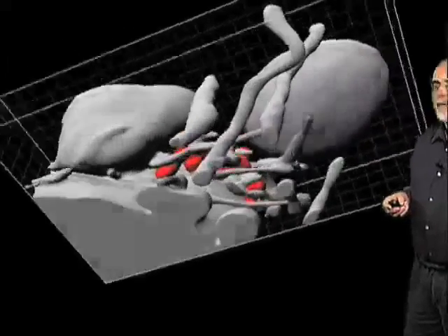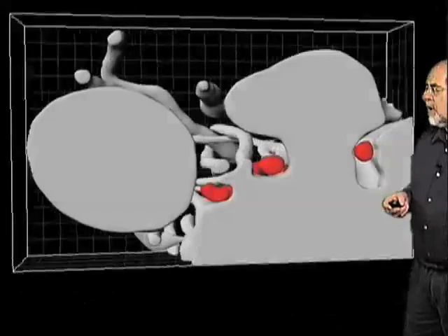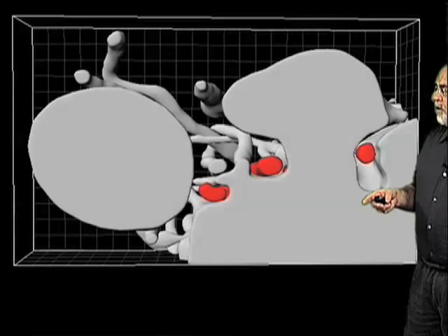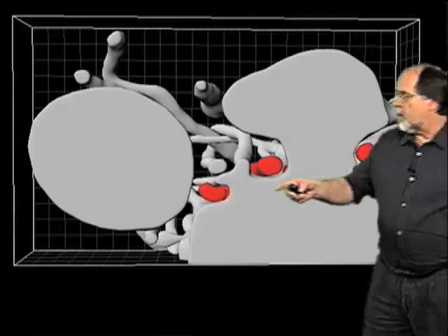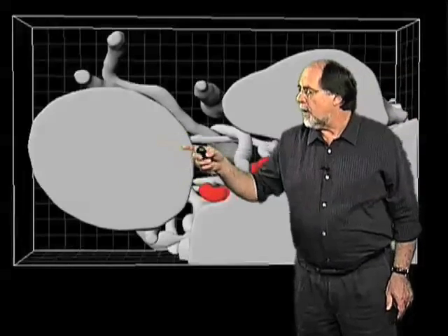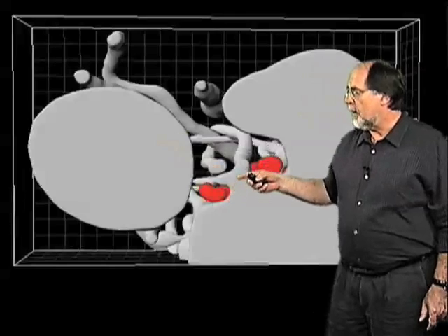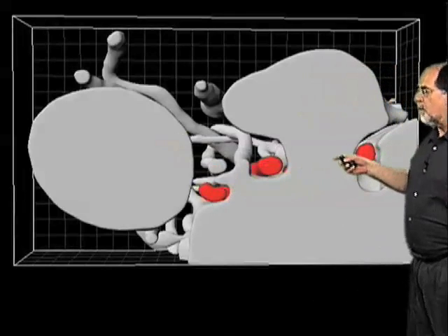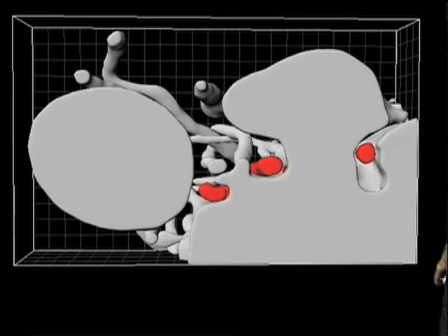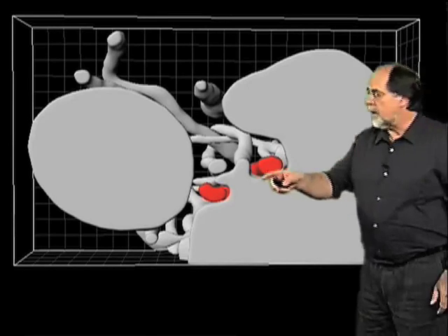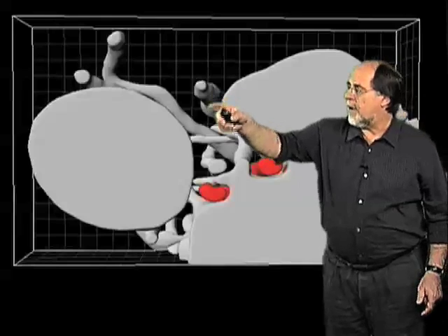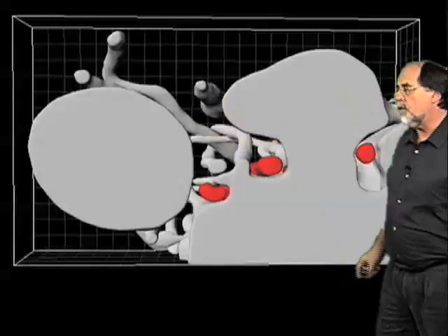The viruses have been pseudo-colored red here and what you see is that the cell surface is modified. You have these blebs forming and the viral particles seem to be endocytosing on the backside of the blebs into the cell. But you also can see here are the filopodia which extend out along which the viruses move towards the cell.